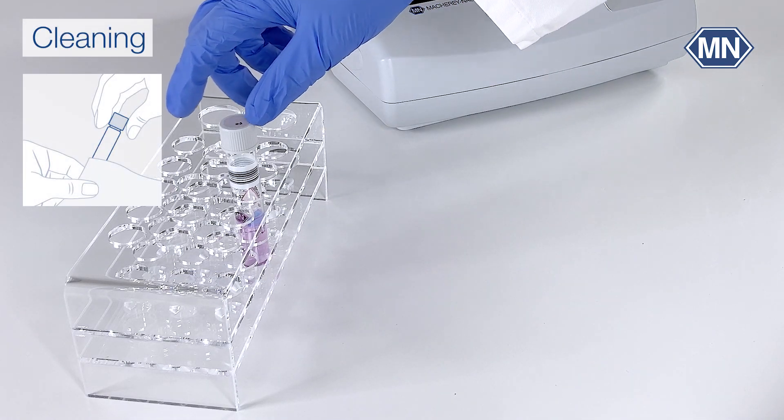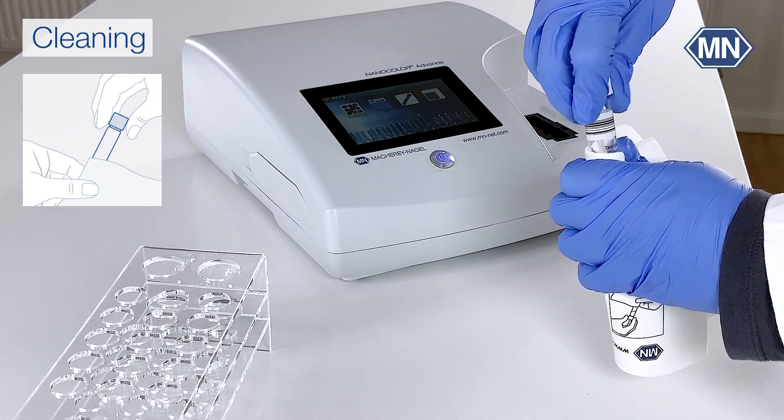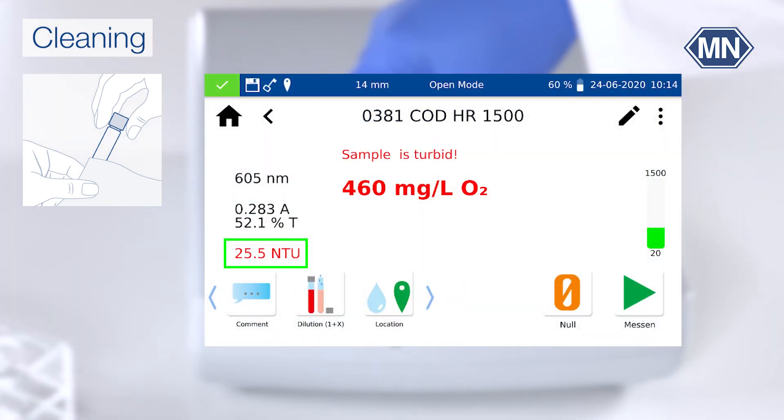Clean the test tube thoroughly. Check the test tube for turbidities, as the tests are sensitive to turbidities. Make sure to have the NTU check always activated to prevent wrong results because of turbidity.